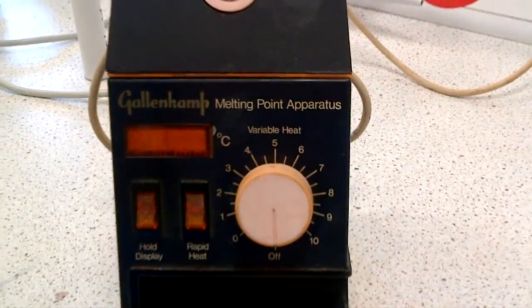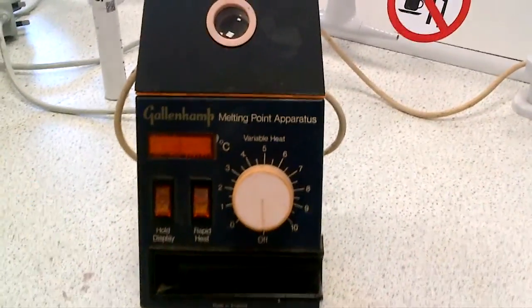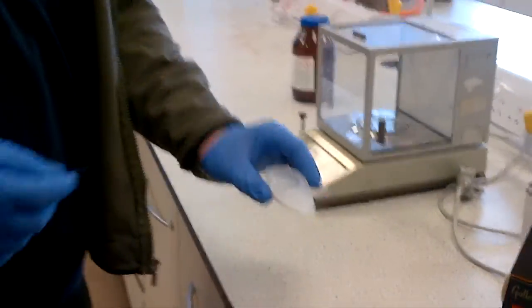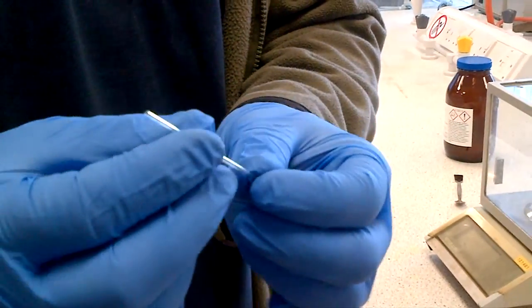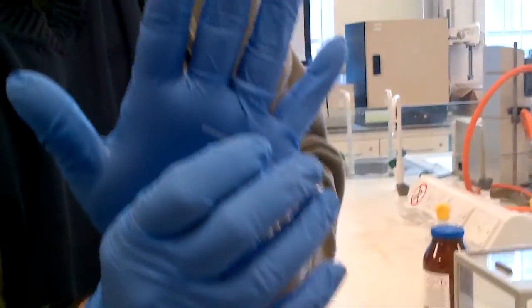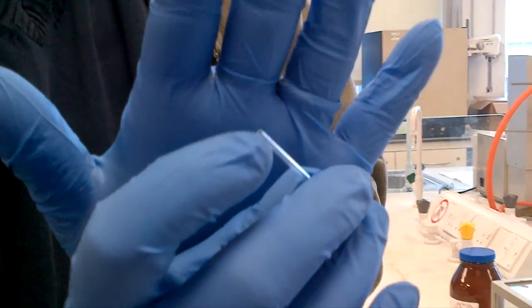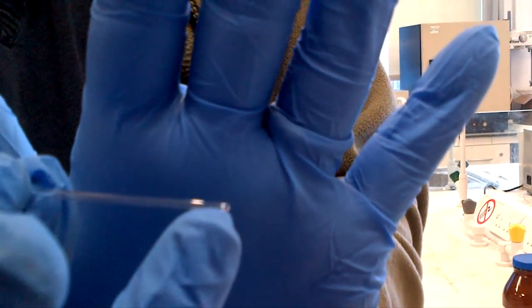So we'll just turn it off for the moment, let it cool down, while we show you how to make the sample up. So inside of here there is some salicylic acid, and there is a melting point tube as well that fits into one of the three openings. The melting point tube, I'll just show it with a glove, there is an open end and there is a sealed end, and the sealed end goes down that way.